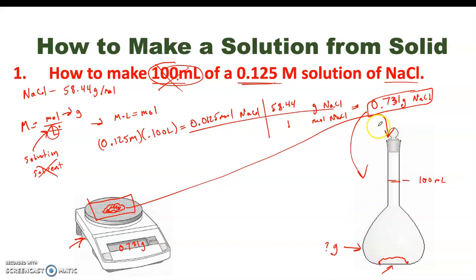The next step is I got to add water to this. So I got to add water, but I wouldn't fill it up right up to the 100 immediately.